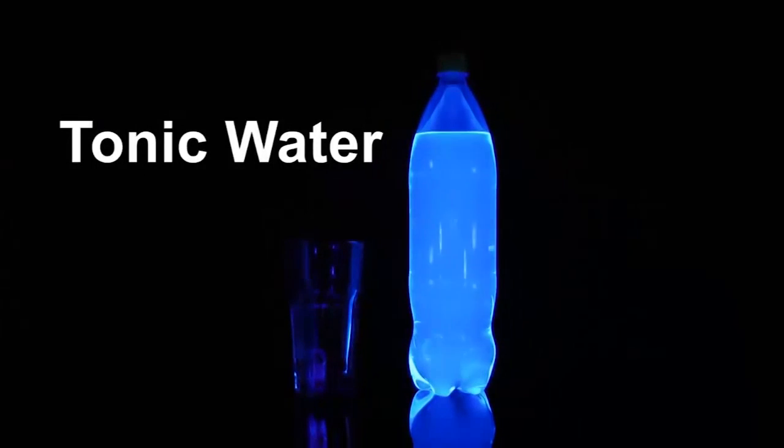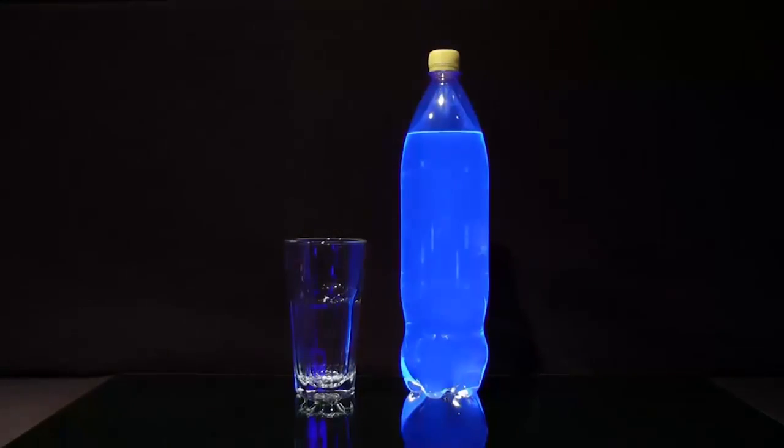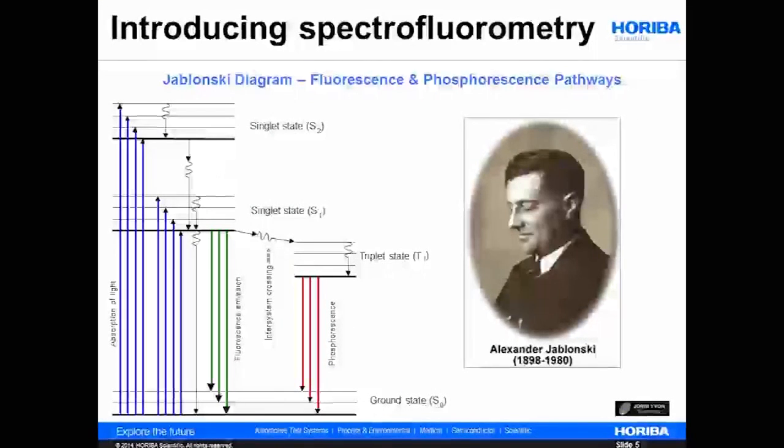The wavelength of the photon which is released corresponds to the gap between the ground state and the first excited state, making the phenomenon specific to a kind of molecule or bonding. The competing phenomenon, in red on the picture, allowed for some molecules due to their structure, involves a specific level, the triplet state, which has a long lifetime. This is known as phosphorescence.